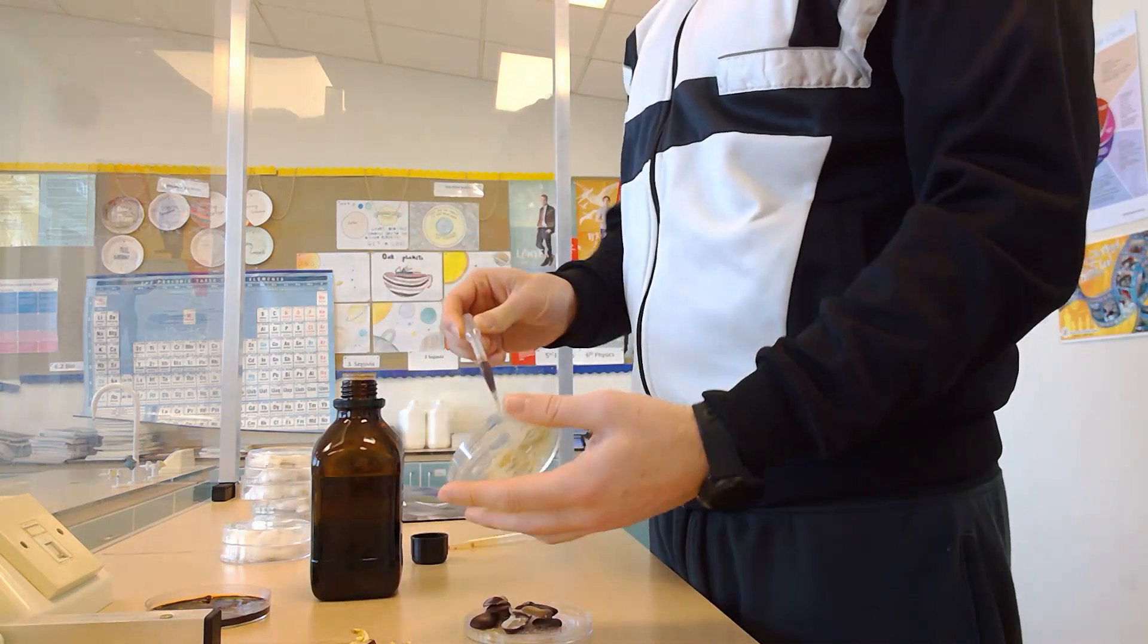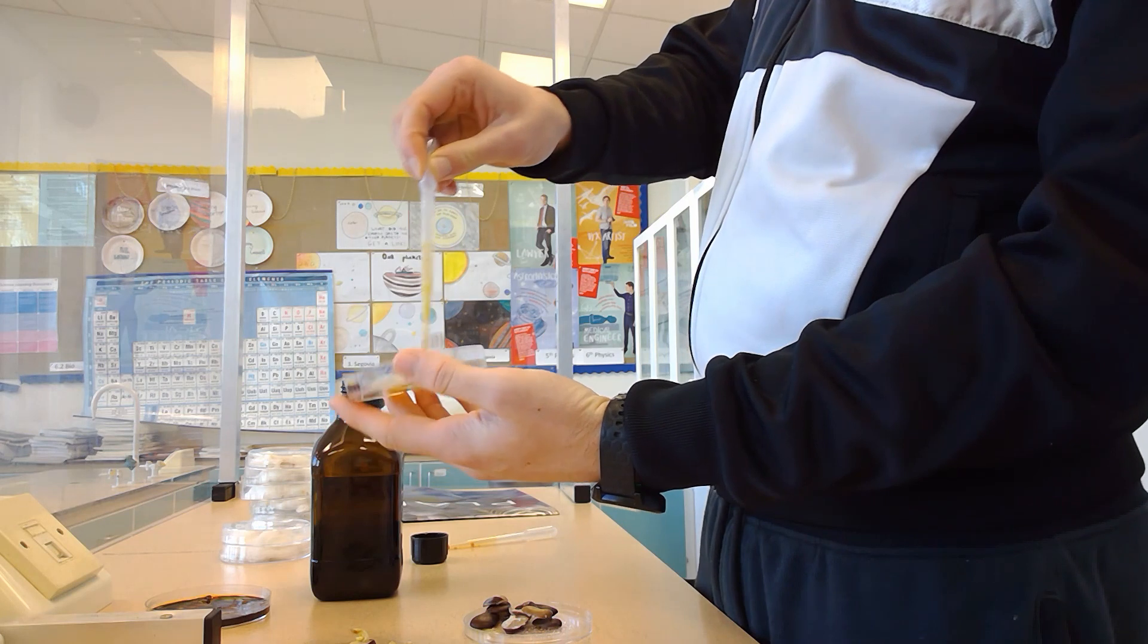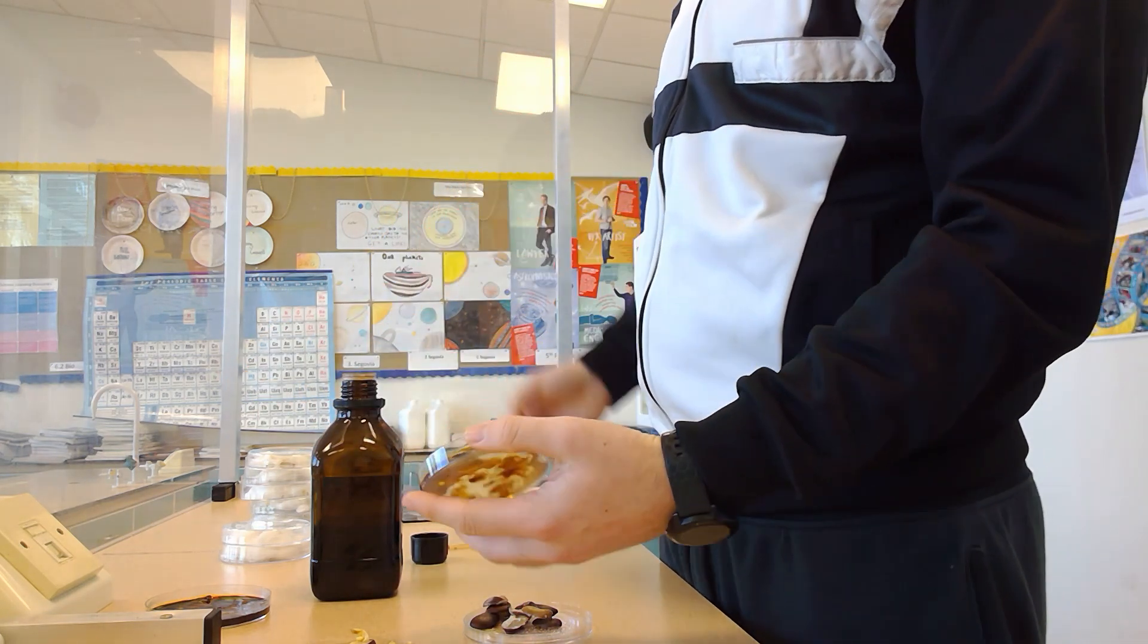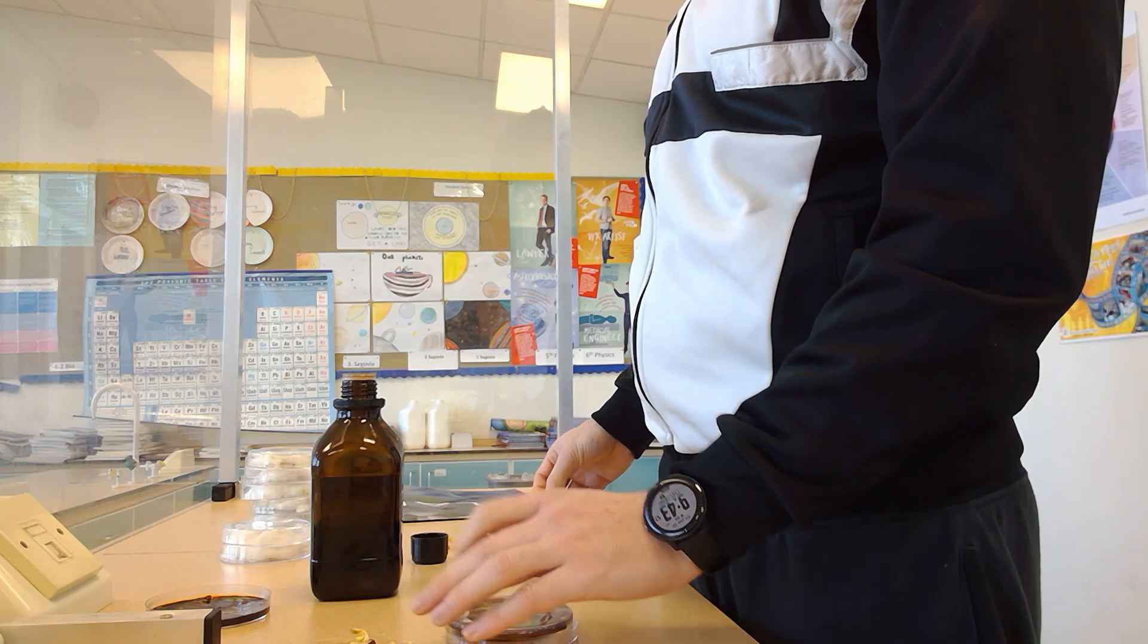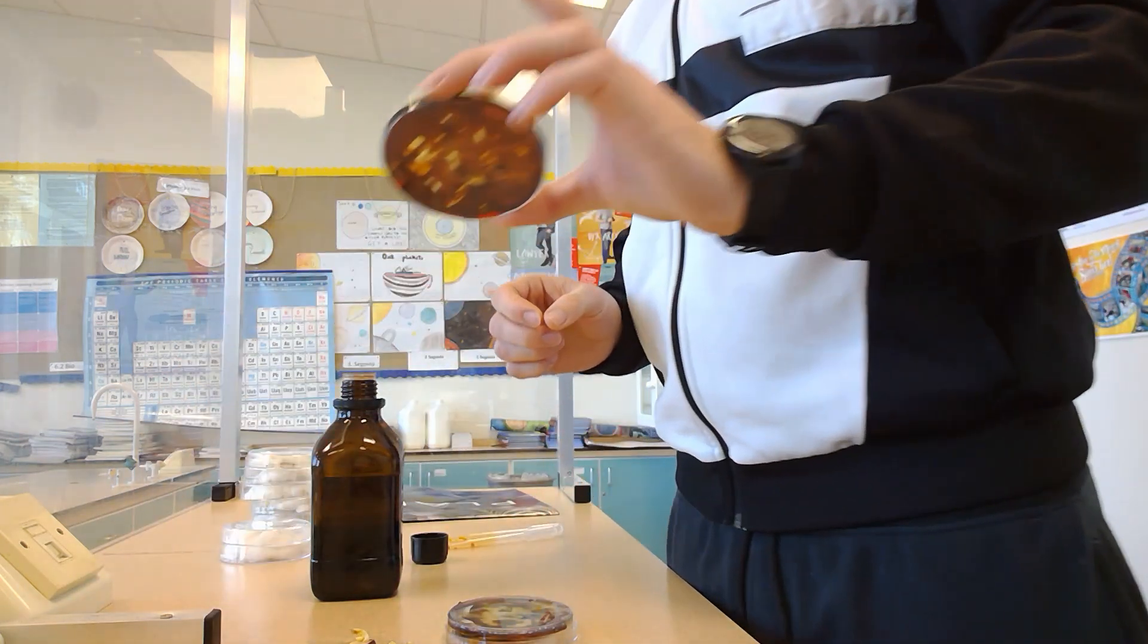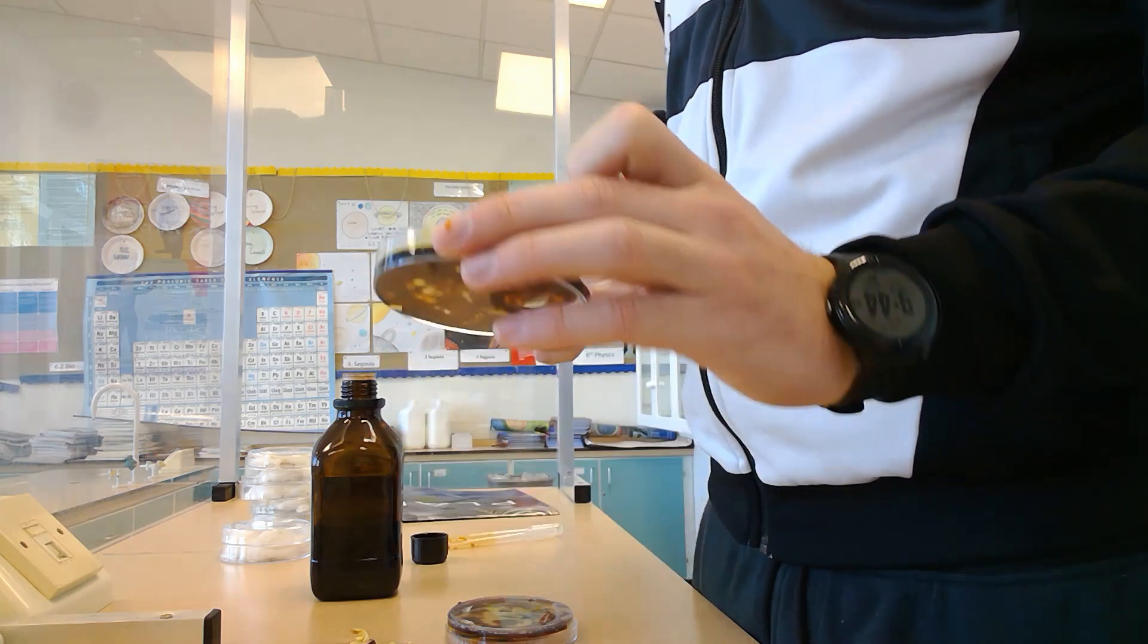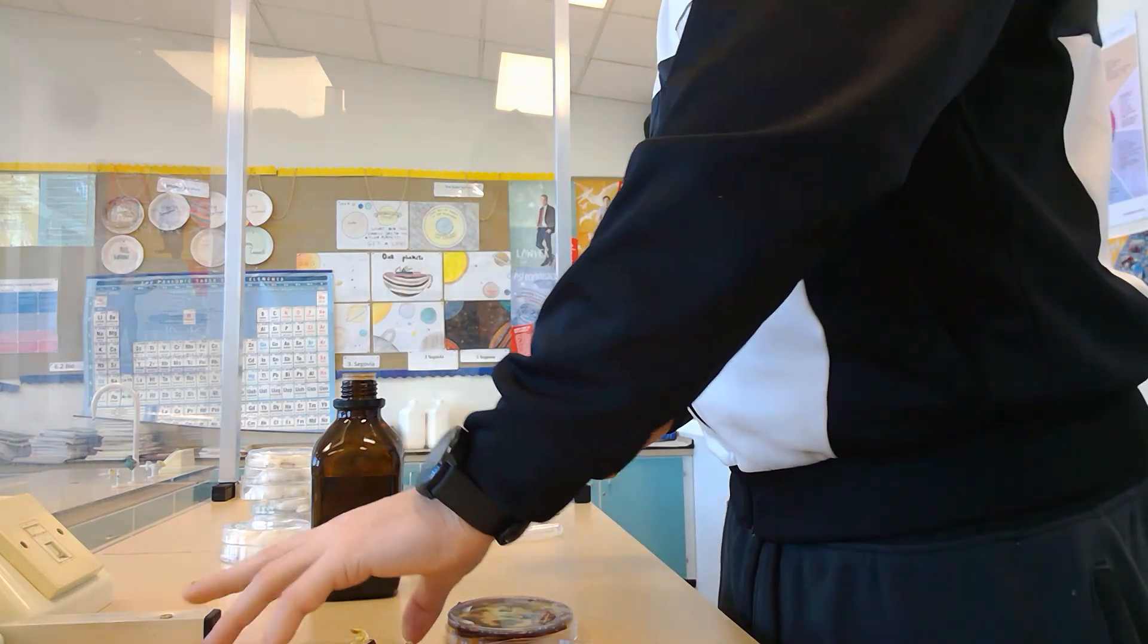The control plate wasn't as efficient—there was growth of some fungi or bacteria, so the plate got contaminated somehow, but it doesn't really matter. We're interested in the experimental plate, where you can see clear areas with no starch present, proving the seeds digested starch during germination.